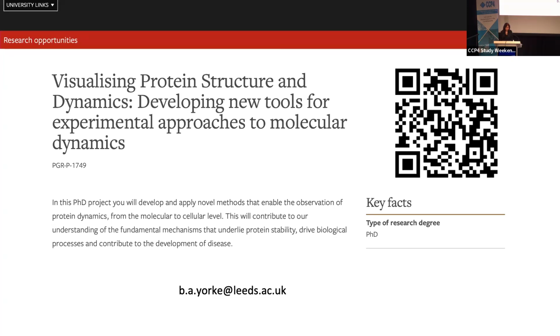And Miranda Lynch asks, in the batch analysis under the rope analysis, the pronounced spread in the two fresh structures is noticeable in the clustering. Does that imply that those structures themselves are more variable, or that the motions are more pronounced? I think it just shows that we might not have enough data from the fresh structures to be able to see the clustering very well. But there may be more variation in that structure than the other two.